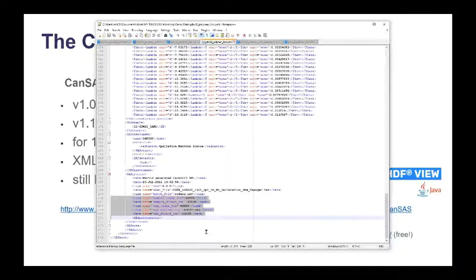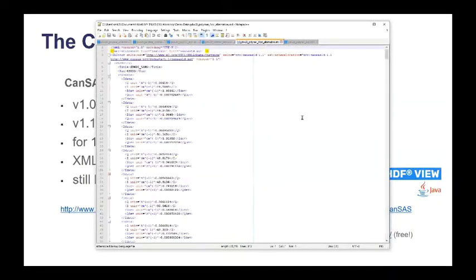So there is an awful lot of very valuable information in this particular version of the data. Because it's XML and it's describing how the data is packaged, it doesn't have to look like this as long as it still conforms to XML. So I'm now going to show you the same data in XML, but looking somewhat different. And that's one of the beauties of XML.